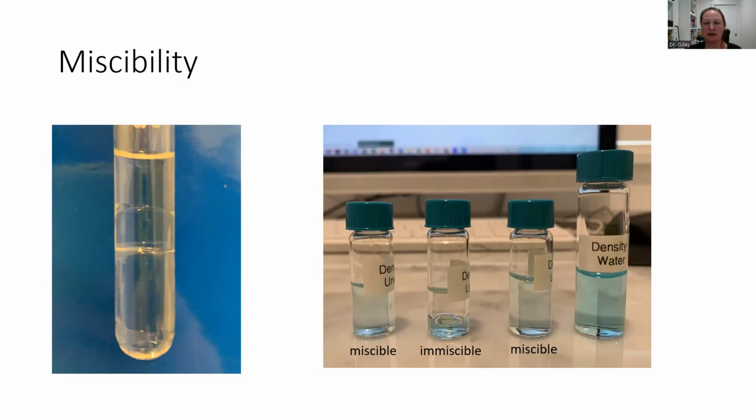So again, we're first going to look at whether or not the three substances are miscible with water, and we're going to take careful observations and record those in our data sheet. Then we'll add some of the colored water directly to our density tower, and we'll note exactly which layers the colored water goes into. Then we're going to stopper the test tube, shake it up, and then allow the layers to settle, and it can take a long time for the layers to settle, up to an hour.